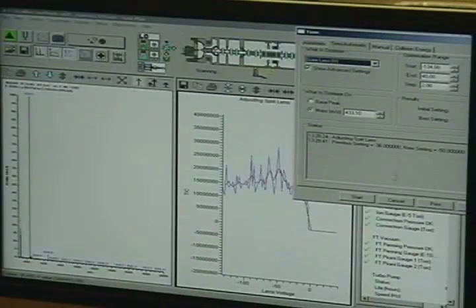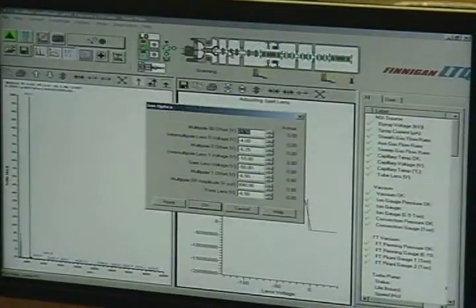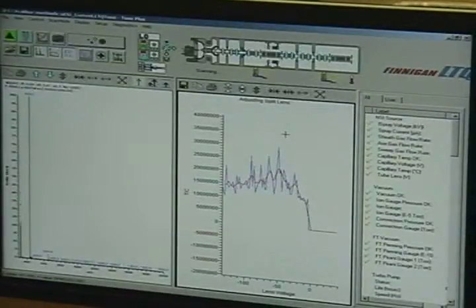Okay, hit cancel. Okay. Open up your multipoles. See if it's sequentially low. Yep. And then it looks good. 5.5, 6 1/4, 6.5. Q00, multipole 00, multipole 0, and multipole 1. This one? Yep. Okay. Cool.